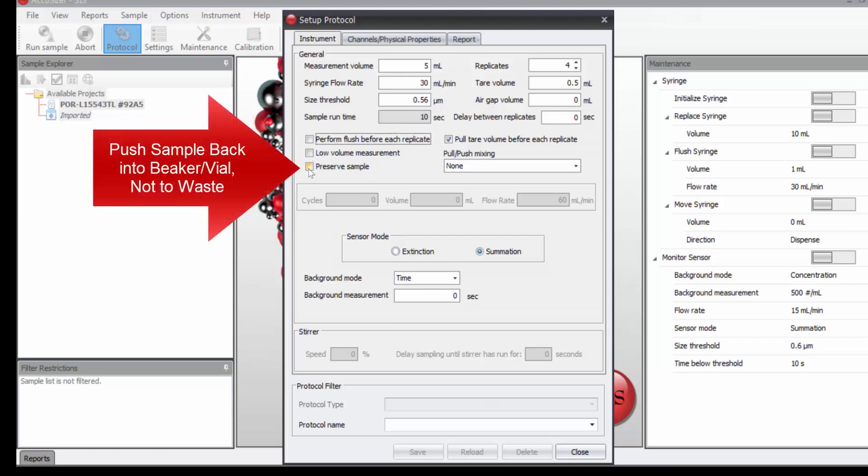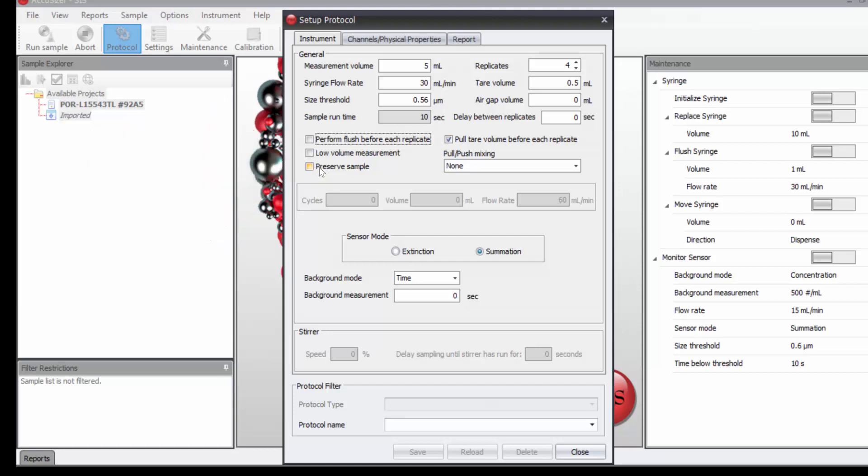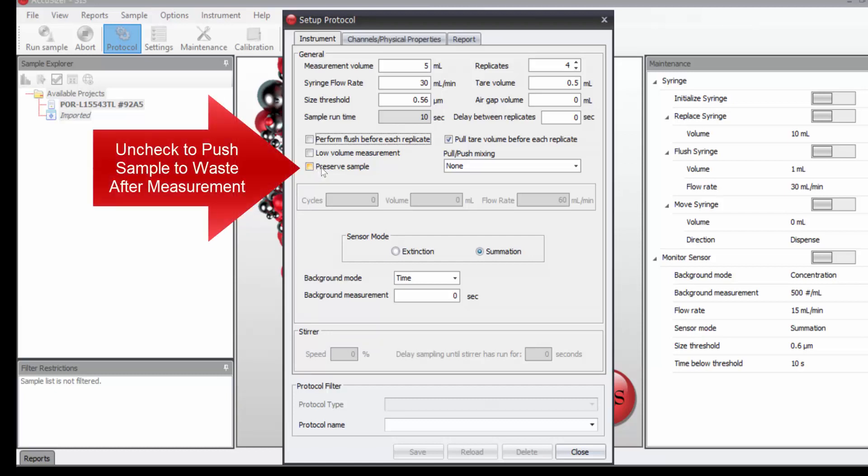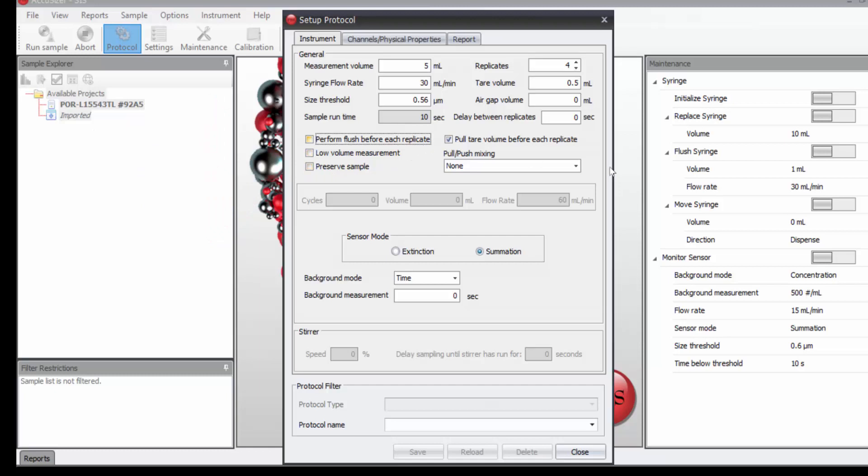To preserve the sample would mean to pull the sample up from the beaker through the sensor for measurement and then back into the same beaker. But instead, since we don't check that, we will pull the sample for measurement and then push it out to waste.